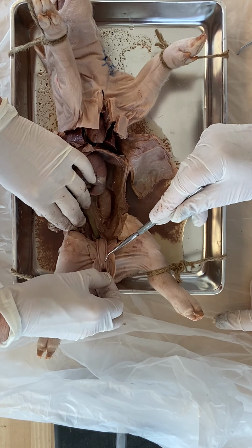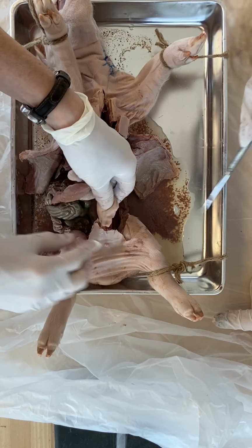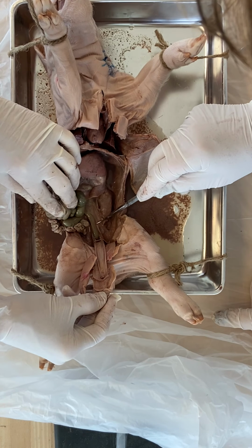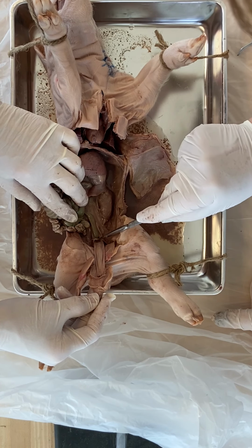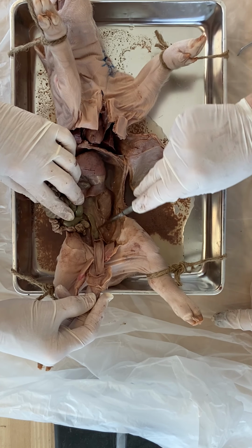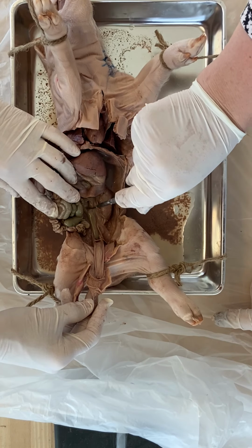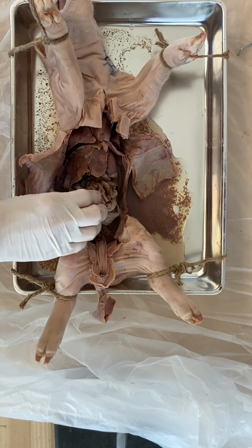Because this was the umbilical artery. So it could be that those are the... Although, is that it? Here's the hole. I wonder if that there is the... You've also got your vas deferens and stuff like that too, and I'm not sure. That's just a little ligament. Is that a ligament holding everything in place? Yes. All right, so here is the rectum coming down from all of this under here. There it is, I'll get the membrane off, the large intestine. There we go. Okay.